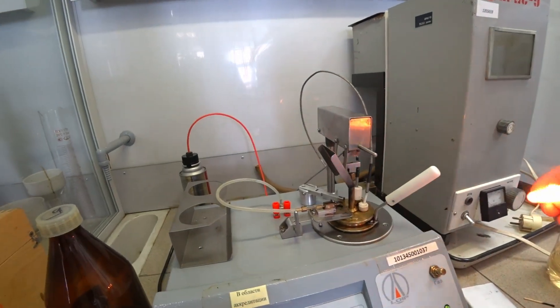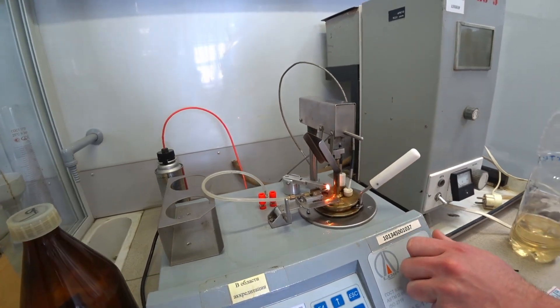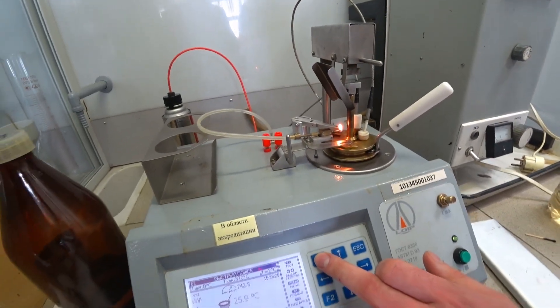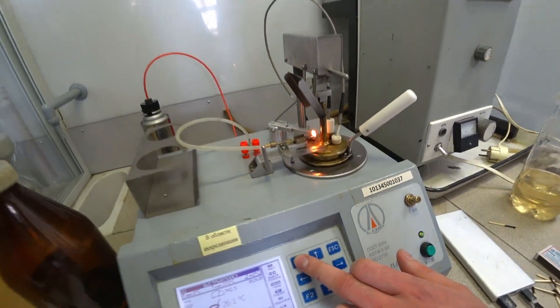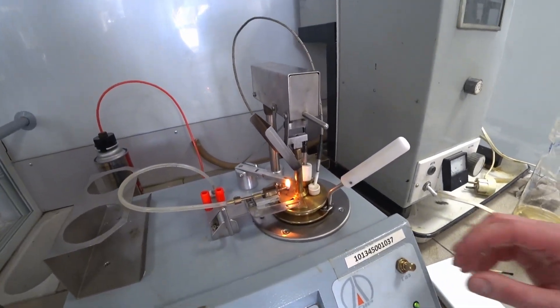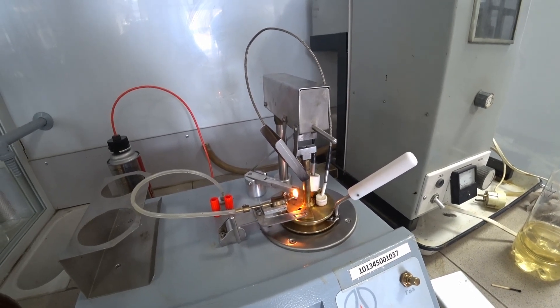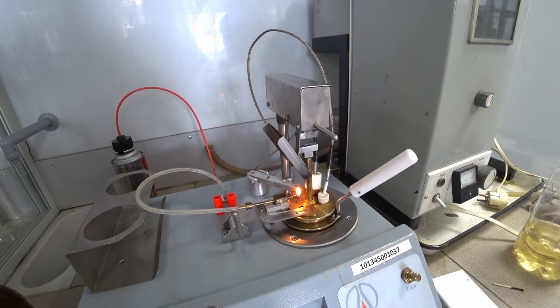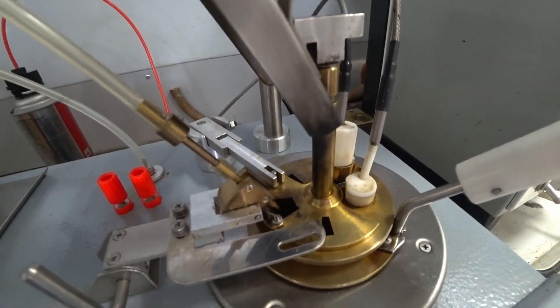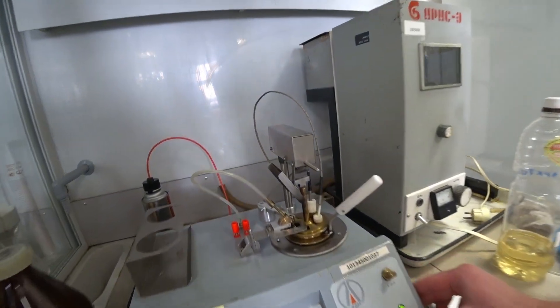We will repeat the experiment again, because at that moment maybe you didn't notice what happened. We have to press the button — do you see it? It's ignited, immediately ignited.